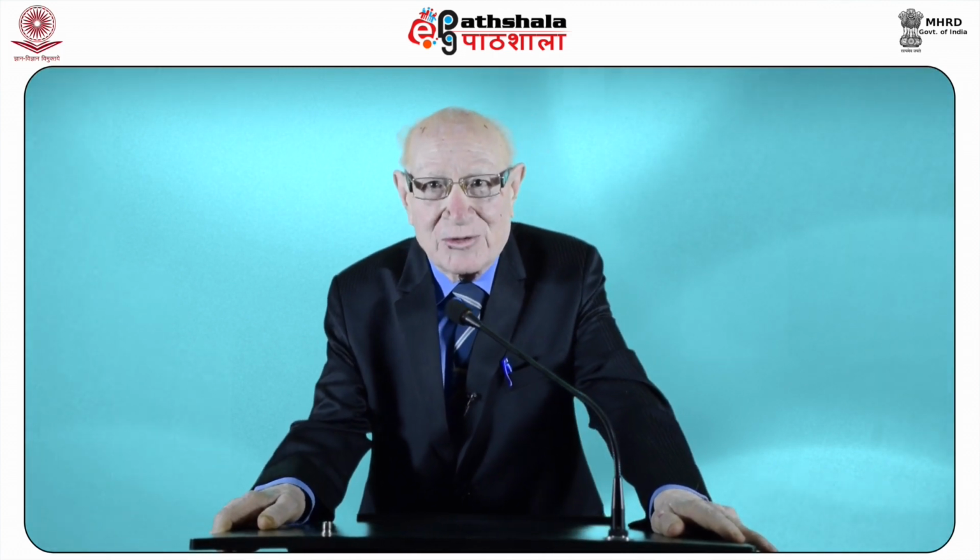There are many instrumental methods, namely spectrography, atomic absorption, flameless spectrometry, neutron activation analysis, and X-ray fluorescence. Out of these, we shall discuss only those methods which are more suitable for forensic science, in the sense that these methods are non-destructive and their sample preparation is not required.